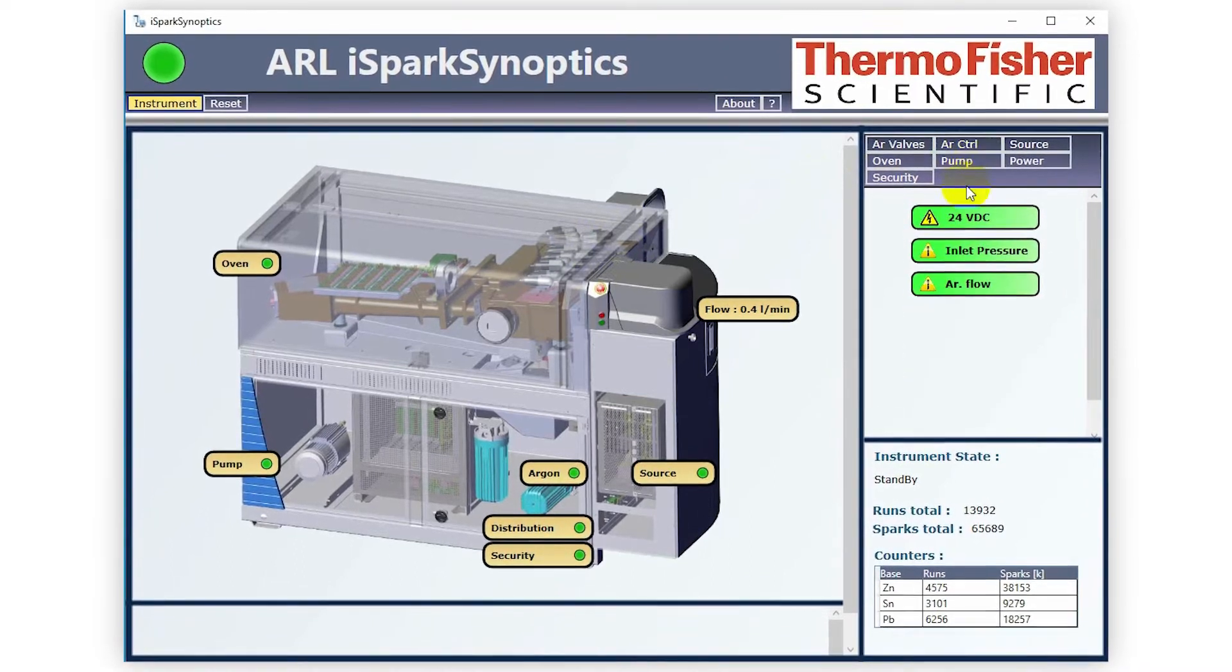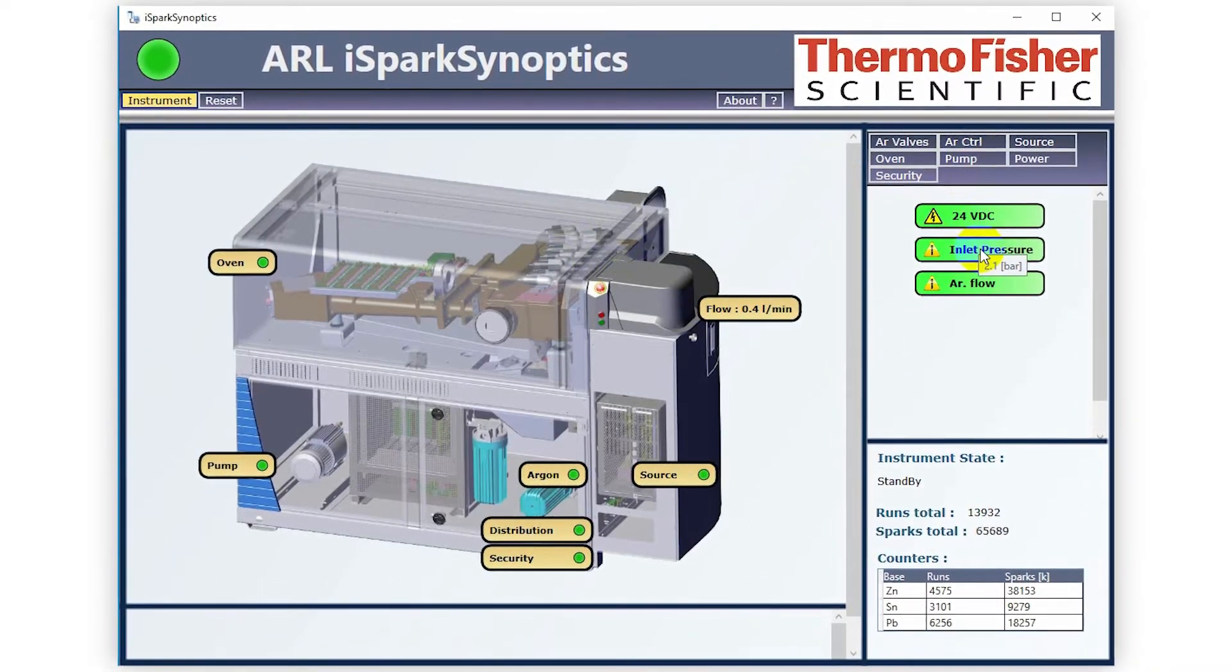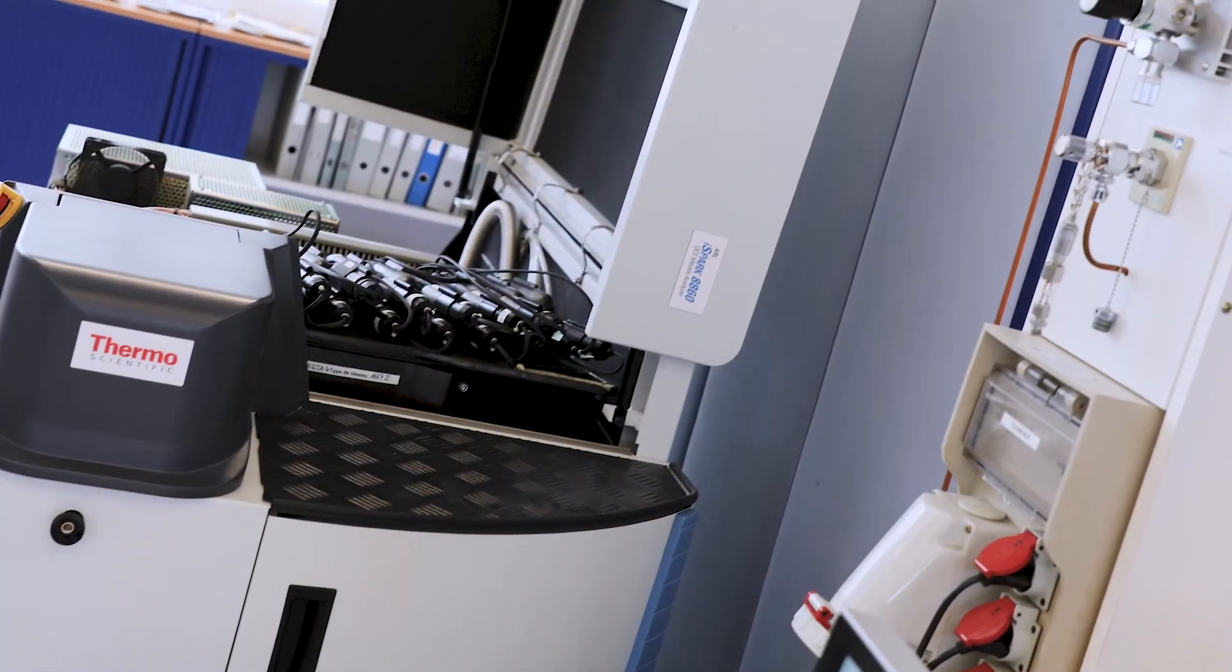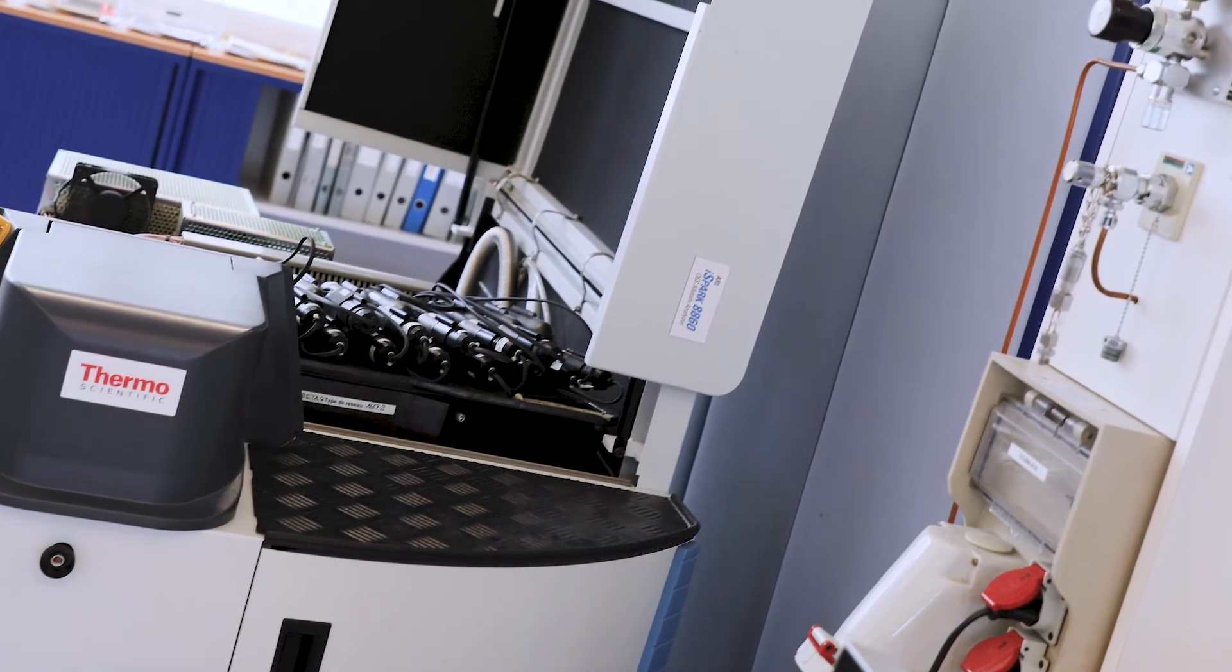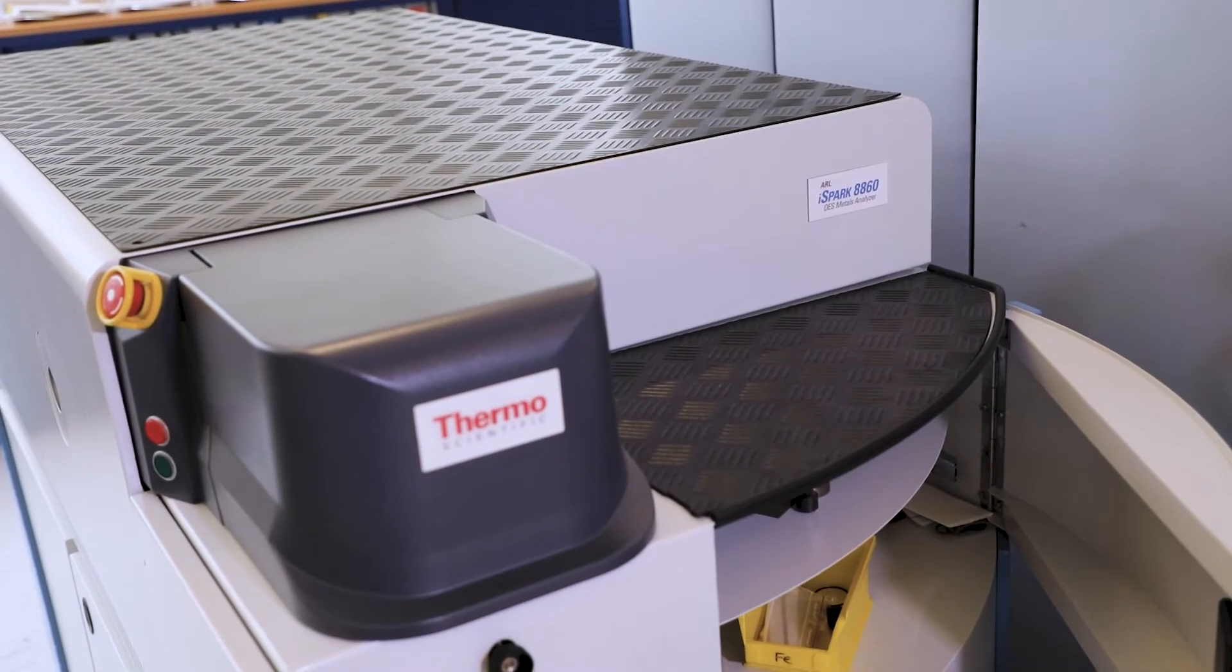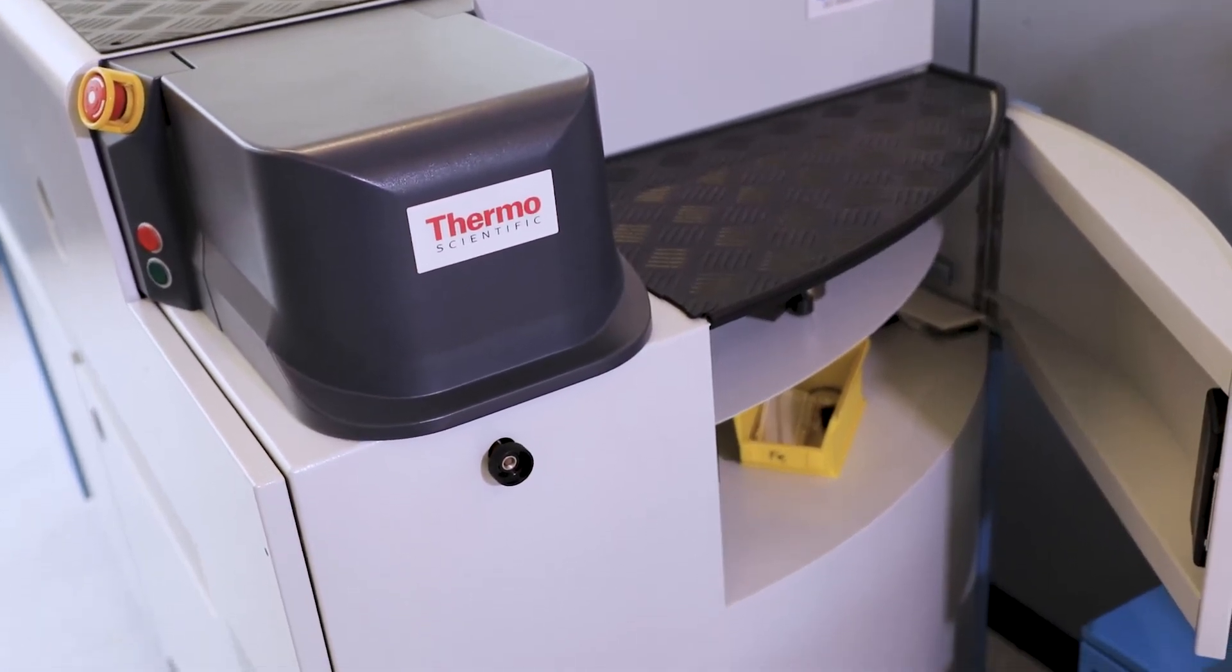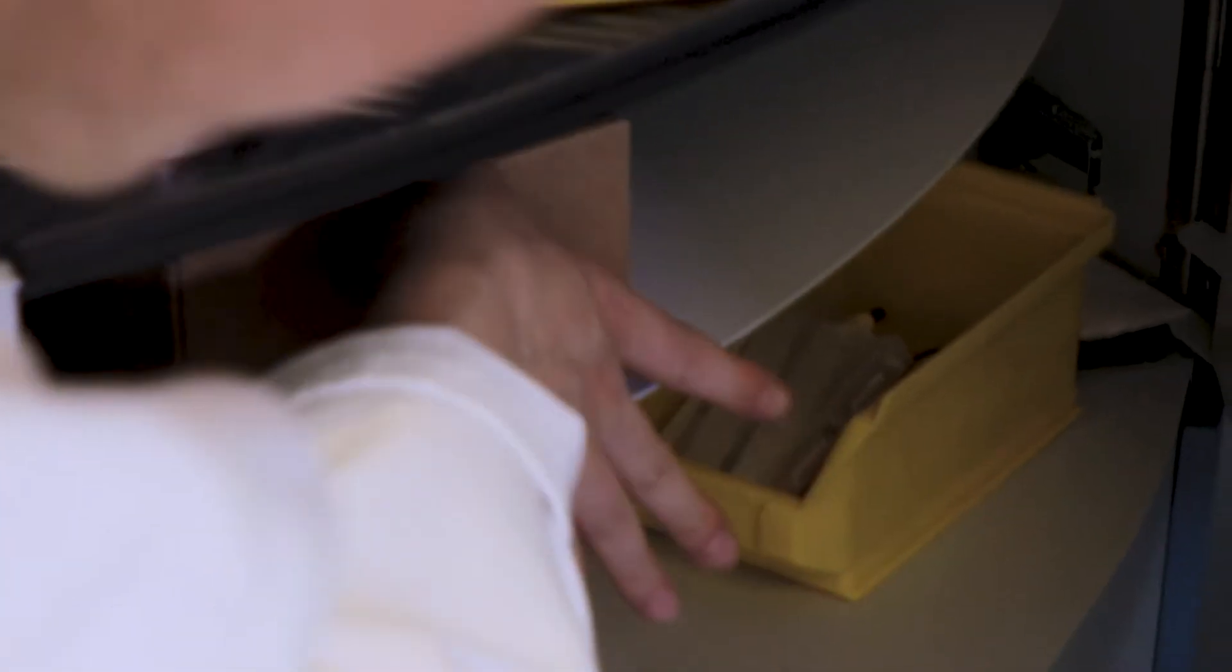The ARL iSpark was designed for increased safety, convenience, and ease of use in daily operation. The instrument can be installed against a wall, or even in a corner, as all the components are accessible from the front. Samples or accessories can be placed on the integrated worktop or in the storage compartment.